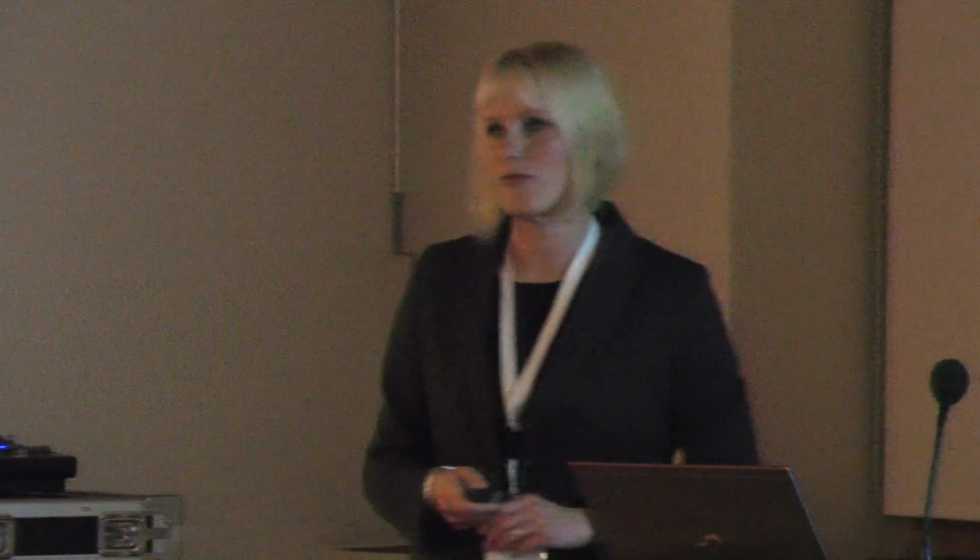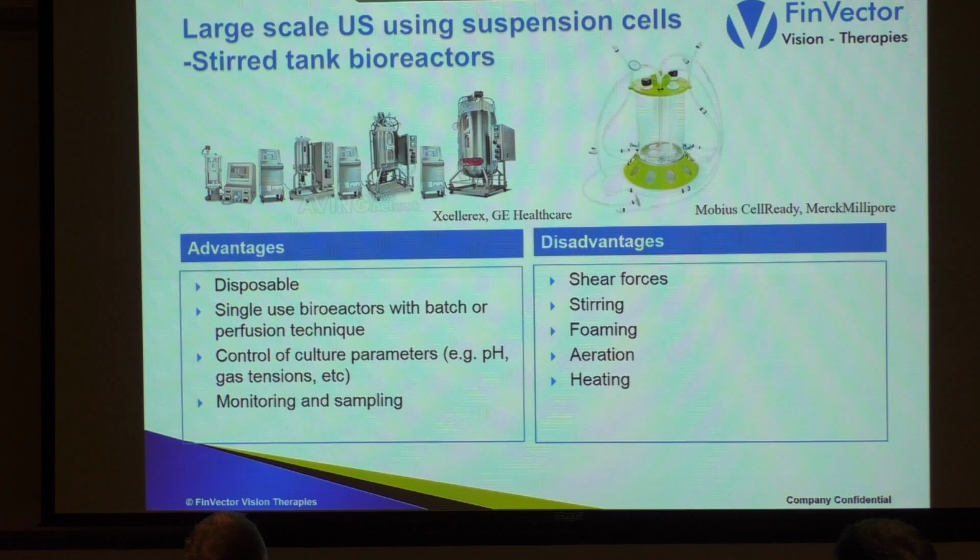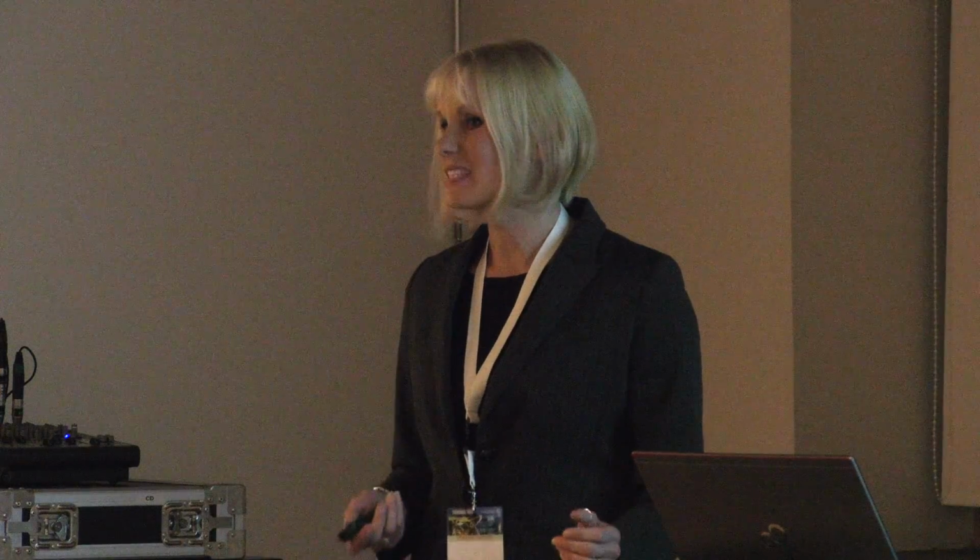Foaming can be, well, you know how beer looks when you have a lot of foam and it looks nice, but it really doesn't look nice if you have a bioreactor full of foam. It will cause problems for your cells, and that's definitely something you want to avoid. You need to keep your cells in very good shape, and viability needs to be good to be able to get very high productivity. And if you have foaming issues, most probably your cells are suffering. And if your cells are suffering at some point of the production, I would even start over, because we have seen that then you will most probably get a very low yield.